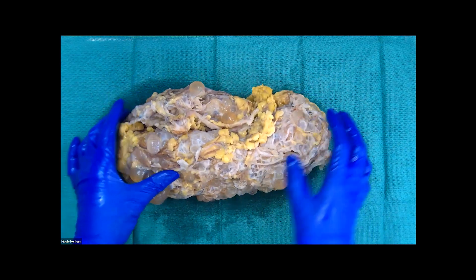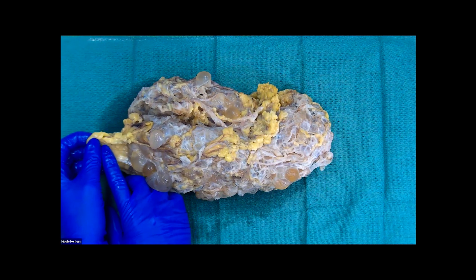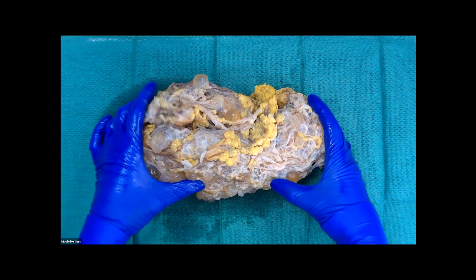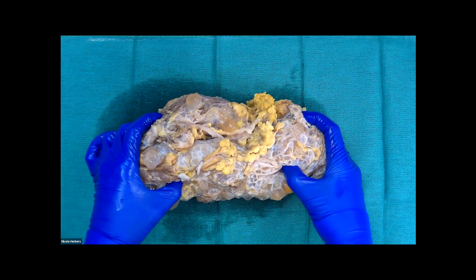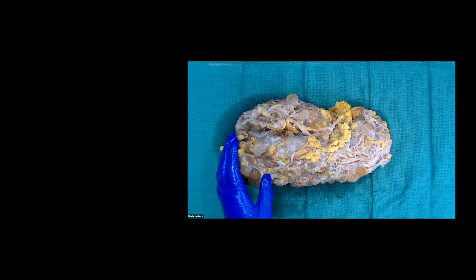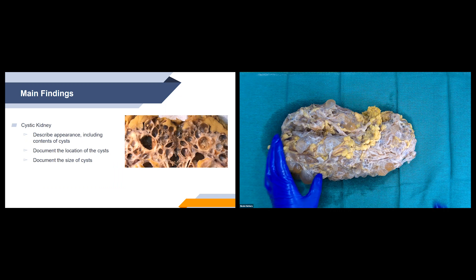Other measurements to include are the perinephric soft tissue — all of this fat located here — and the adrenal gland if present. For our main findings, we describe the cystic renal parenchyma: the appearance of the cysts and their content. The cysts might be filled with clear fluid, gelatinous material, or hemorrhage.